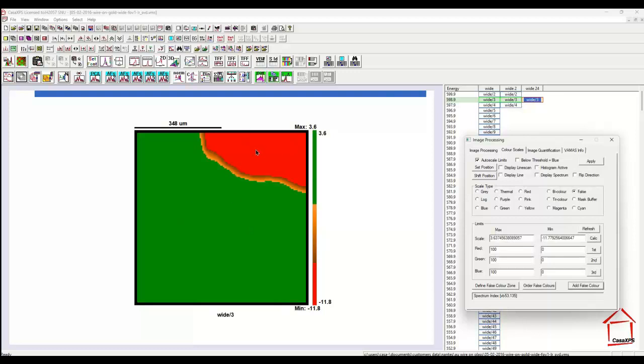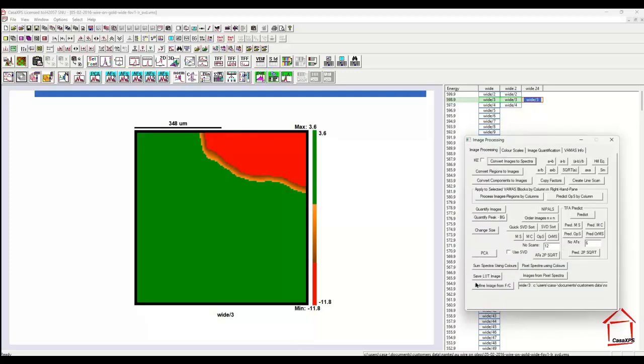So this represents a partitioning in terms of the second abstract factor into where I think there's silver dag and where I believe there's no silver dag. Let us now define this as the false color image. And what this will do is we'll create a false color mask that is specific to the pattern that we see here.